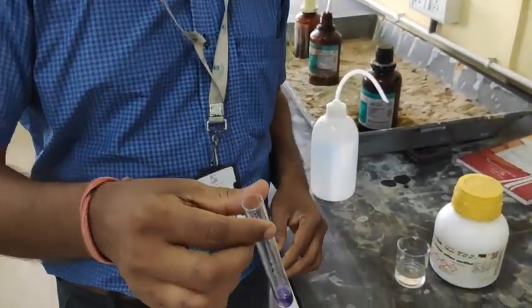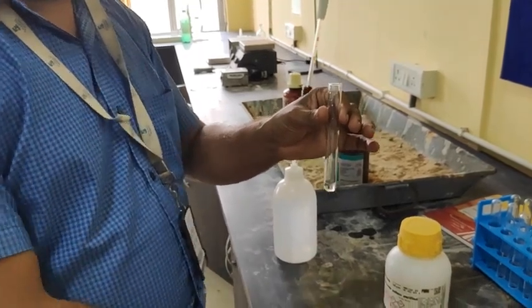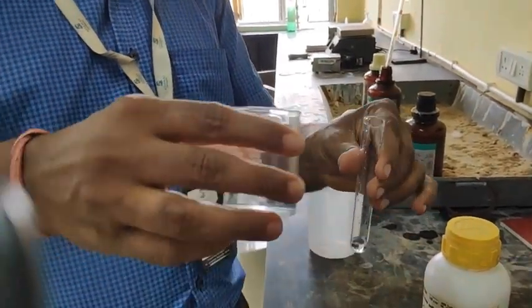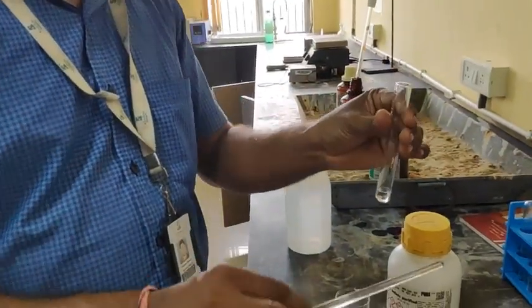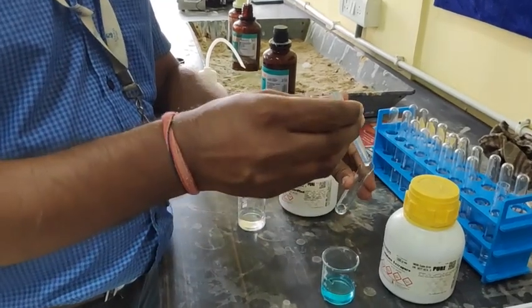Now let's see what happens if we do the same thing in the case of a blank. We are using simple plain water. Please add the sodium hydroxide solution first. The sodium hydroxide solution is now being added, and after that, dropwise, he is adding some copper sulfate.